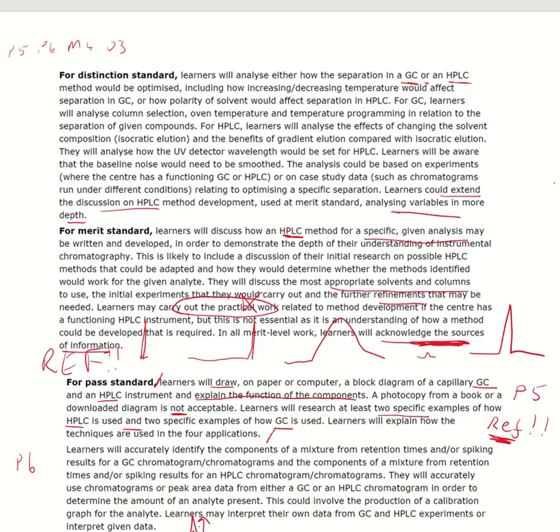If you were struggling with this and you didn't find too much, you found bits and pieces, and it's good enough for the merit bit, GC, I would say, usually has a lot more on the internet for ease of finding afterwards. Now, it gives you ideas of everything when it's talking about optimization. So how would the temperature affect it for GC? Would you want the temperature increase to be fast, slow? Would you want to go from 0 to 300 or 0, 20, 40, 60, 80 and a slow increase?